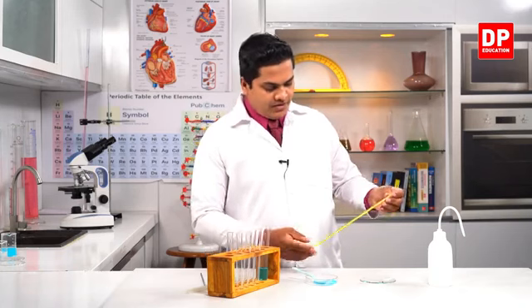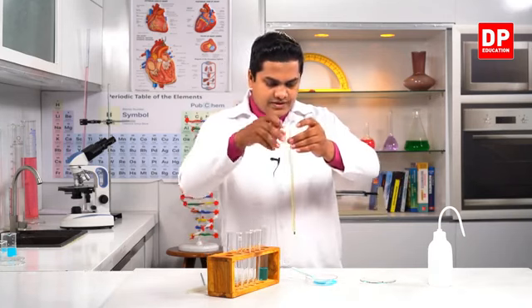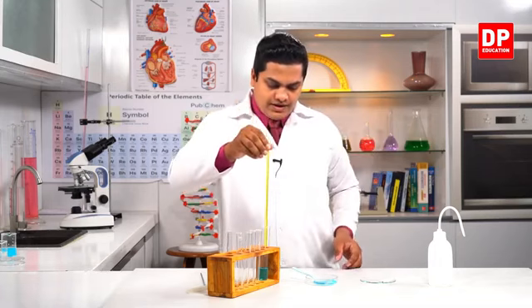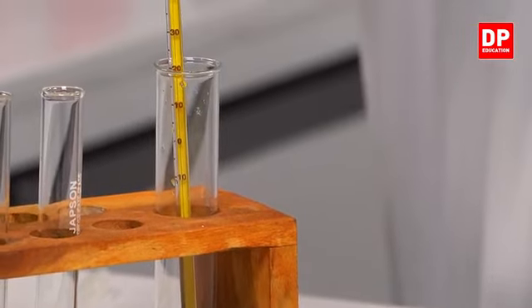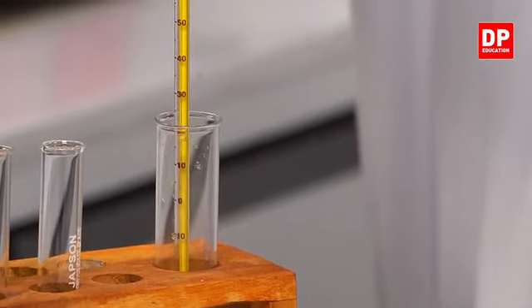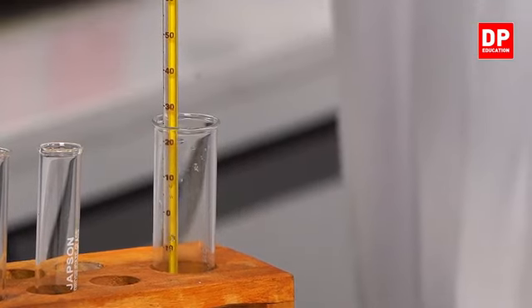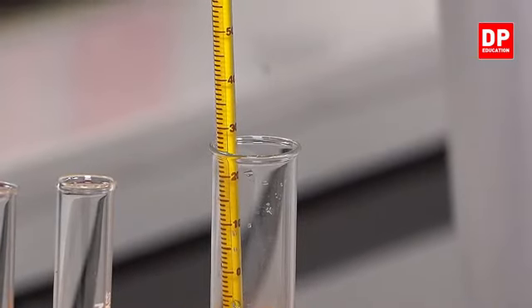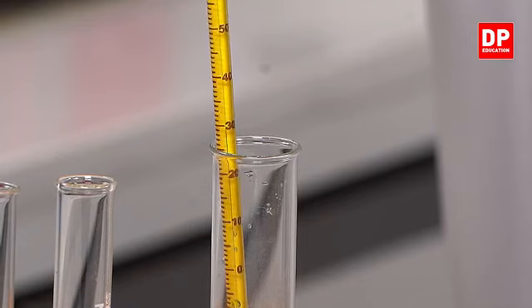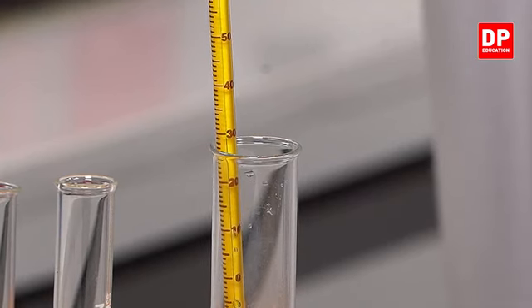So I have the thermometer with me. Let's insert the thermometer and we'll get a reading. Right. So here the initial temperature of the copper sulfate solution is about 30 degrees Celsius. You can see it clearly in here right now. The initial temperature is 30 degrees Celsius.